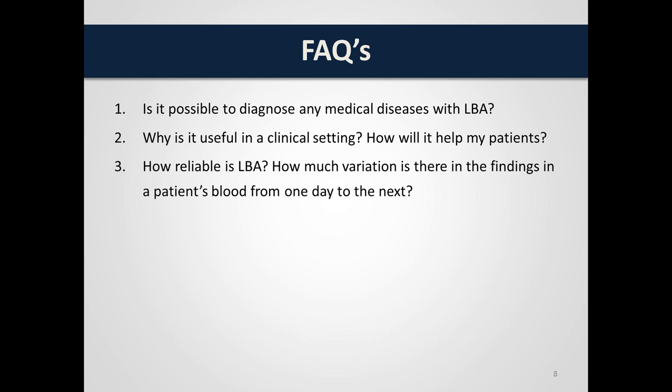Now, in practice, however, we simply don't see this type of variation. Of course, if a vegan decided to have a large steak a few hours before a live blood test, well, then we can expect to see the impact of this in the blood. But for patients following their normal daily routines, the results are always accurate. We actually see the opposite of what is suggested here in practice.